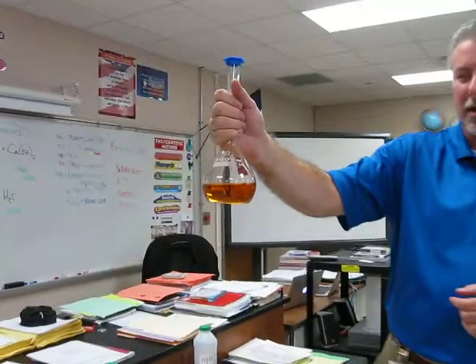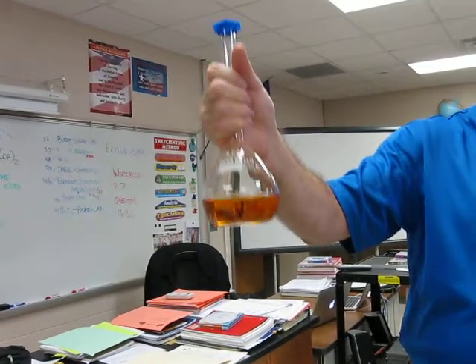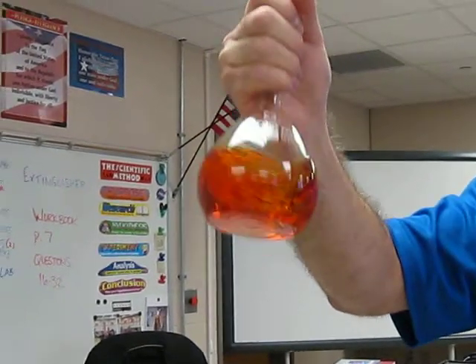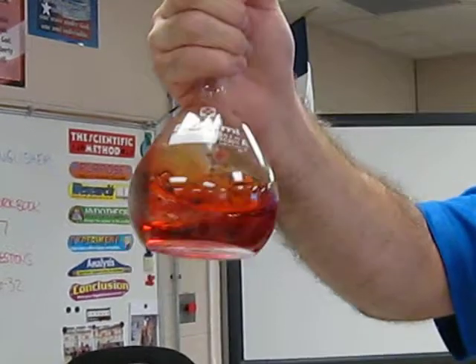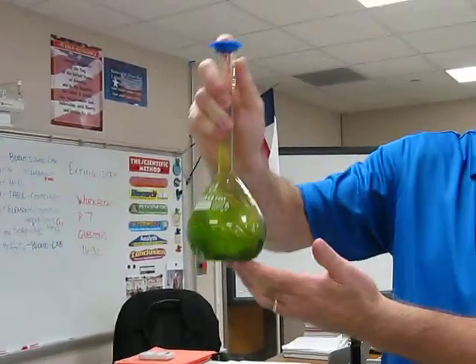So what color is it now, guys? Kind of a yellowy-orange. Now watch what happens when I put a little bit of energy in this. I put in a little bit of energy — and what color is it turning now? So now I'm going to put a whole lot of energy to this — I'm telling you, you're going to turn it on.